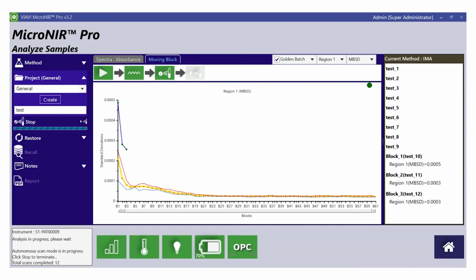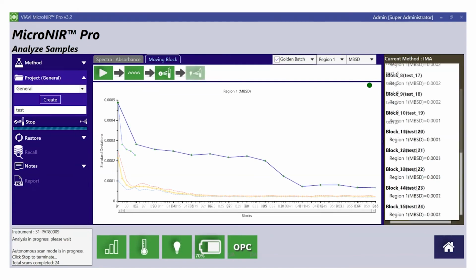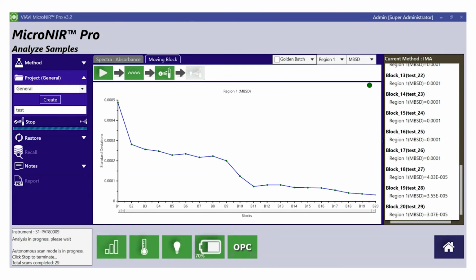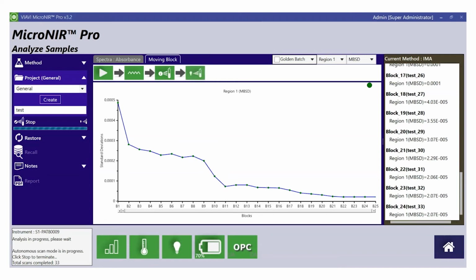The moving block is a very simple algorithm to explain to an auditor, and it doesn't require a lot of statistical knowledge. We can also make a quantitative analysis, but the downside in this case is that it's pretty time consuming. From the blending profile, we can extract very important information. Looking at the number of rotations where the standard deviation is minimum, you can define the endpoint. Looking at the value you reached, you can see if a process is producing a better result than another one.